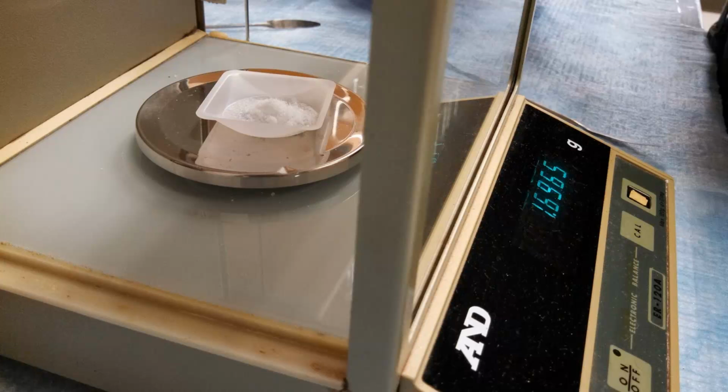To each of the flasks, again for both parts, you're going to add potassium iodide, KI. This will be in desiccators in the balance room. You're going to need about 2 grams for each titration flask. The exact amount doesn't matter, it just has to be over 2 grams because this reactant has to be in excess.